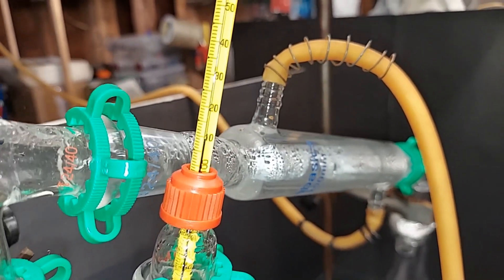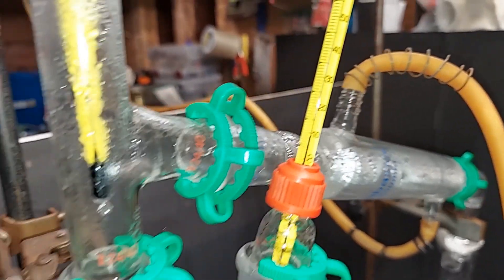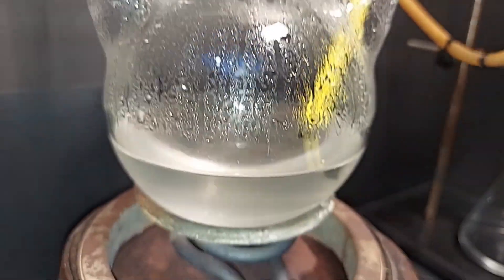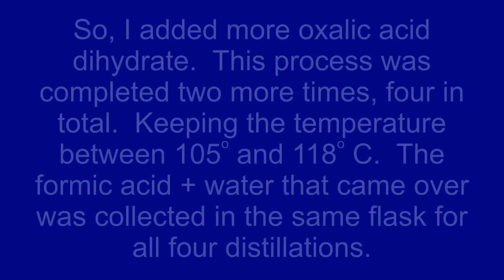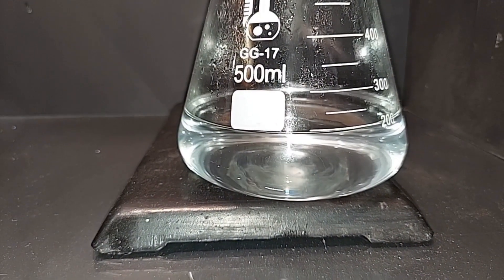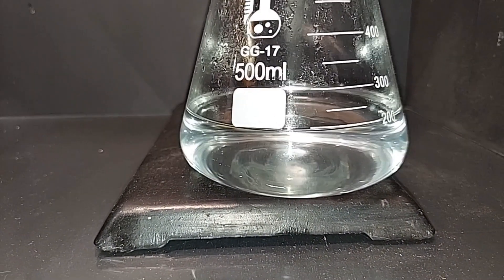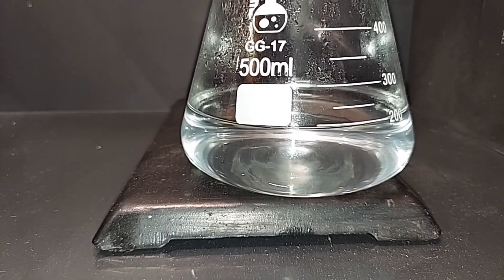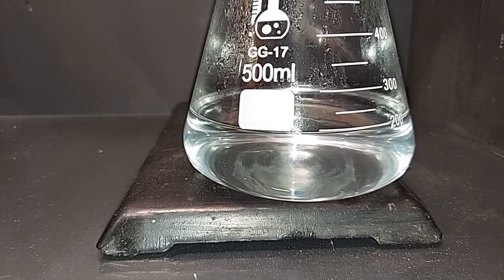Temperature is right around 110 degrees Celsius and there's barely anything happening at the bottom, so we're going to stop this, let it cool down to about 27 degrees Celsius, and add more oxalic acid. Adding our second batch for formic acid collection — the third overall. Turning on the heat again. After the subsequent runs, our final collected volume is 200 milliliters and now we have to distill this fractionally to get a higher percentage of formic acid.